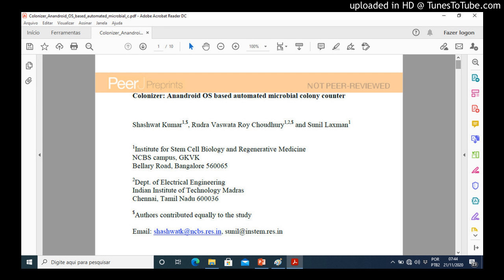Repeatability. To ensure that the app performs consistently, we took multiple measurements of the same plate on 2 different phones. Low variance in the counts on both shows that the algorithm counts do not fluctuate on repeating the measurement. Table 1 illustrates the entire dataset of counting colonies using multiple smartphone models under different image acquisition conditions.